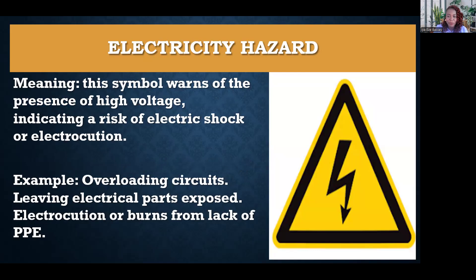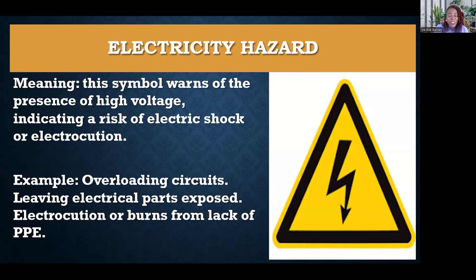Electricity hazard — this means that there is the presence of high voltage, and you could get an electric shock or be electrocuted. This can happen when circuits are overloaded, electrical parts are exposed, or from electrocution due to lack of PPE.